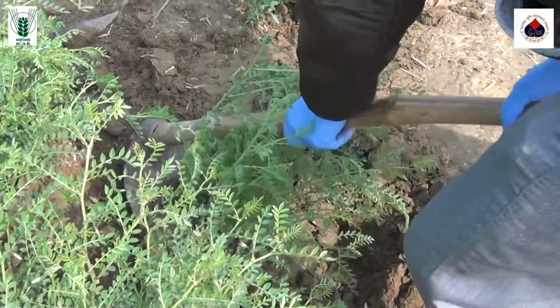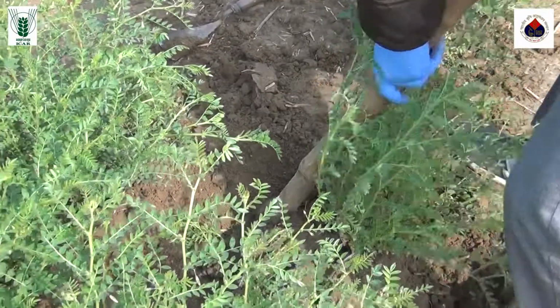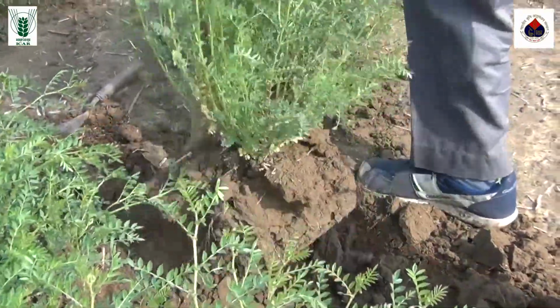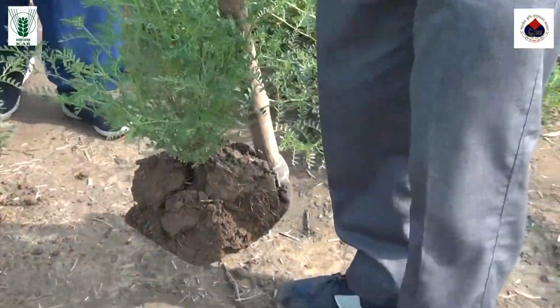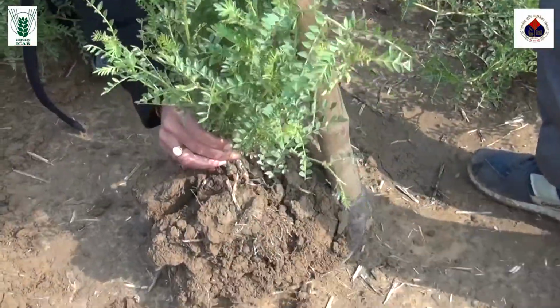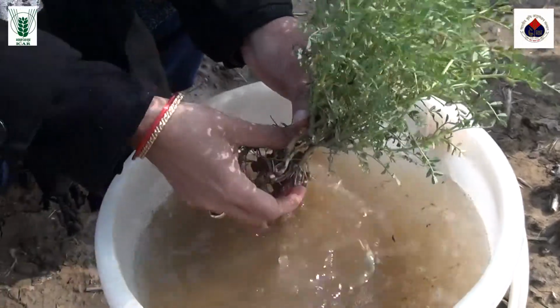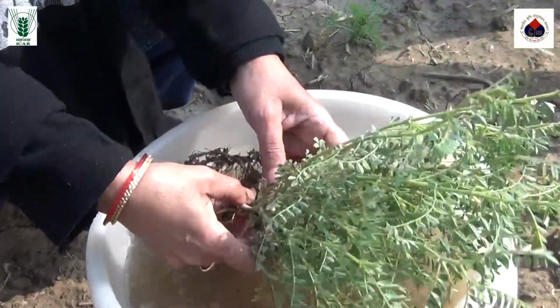Now once you uproot it, it will come along with the soil. Try not to disturb the soil too much with your hands, because that may break the lateral roots. It may also break off the nodules. It is better to immediately wash the whole thing so that the soil is removed from the rooting system. Do 2-3 washes so that the root system looks very clean and the nodules are observed very cleanly.